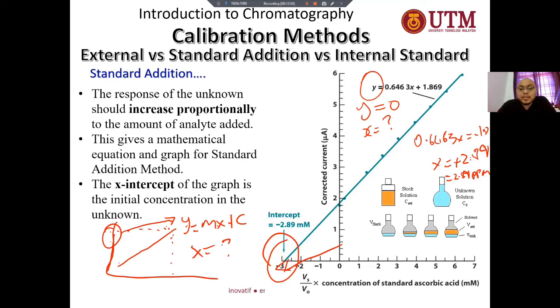But again, for example, in the future you need to perform the standard addition. For example, you get 2.89 ppm from this analysis.